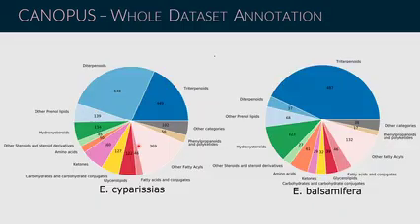And you can then make nice statistical bird's eye view analysis on your data set. So you can check how much of my data set belongs to which compound class and try to compare different conditions or organisms or whatever.